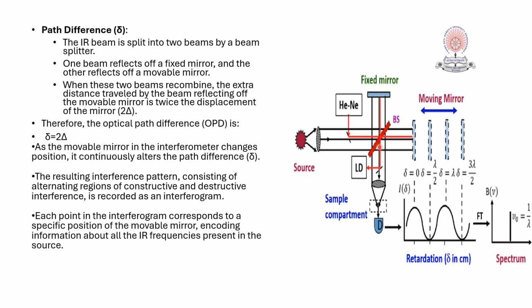After interference, the light is absorbed by the sample. A part is transmitted also. The transmitted light is received by the detector, and the detector passes the signal to the CPU that Fourier transforms the signal, and finally a spectrum is created.